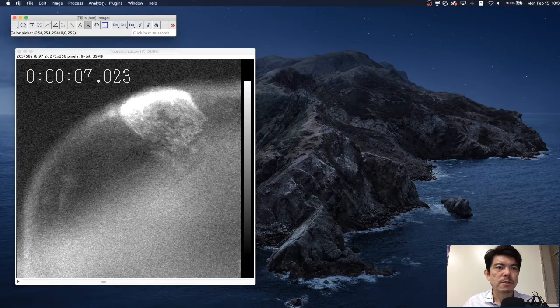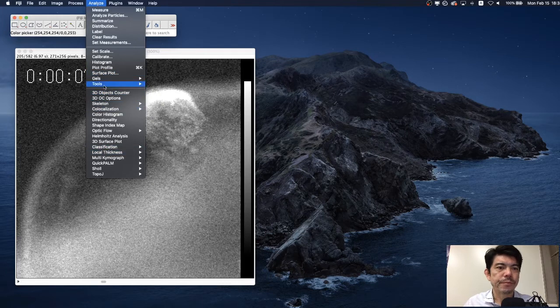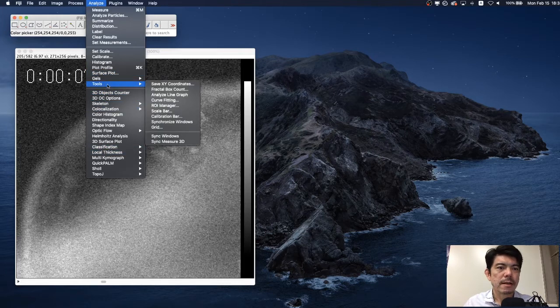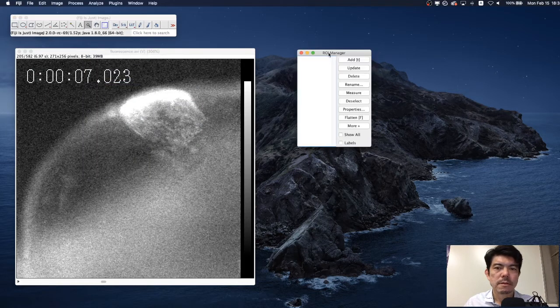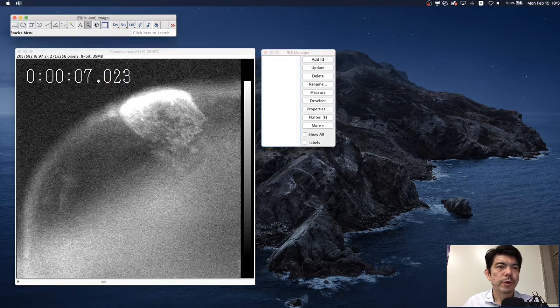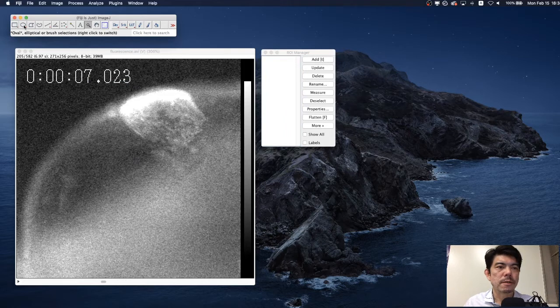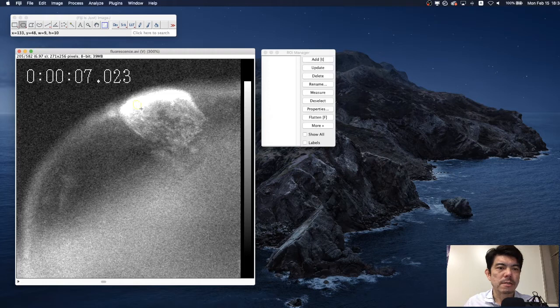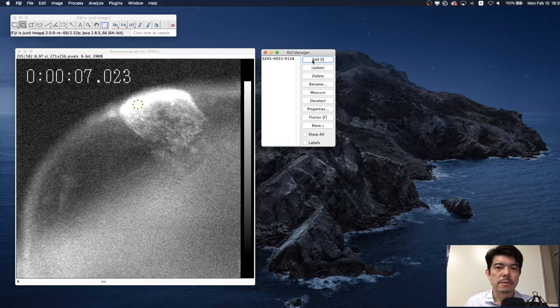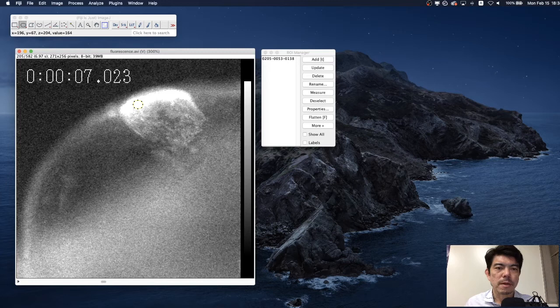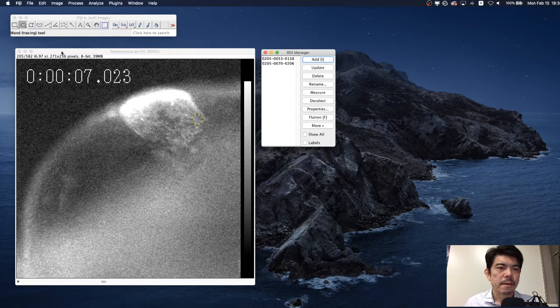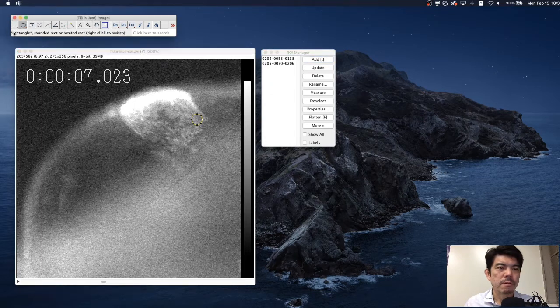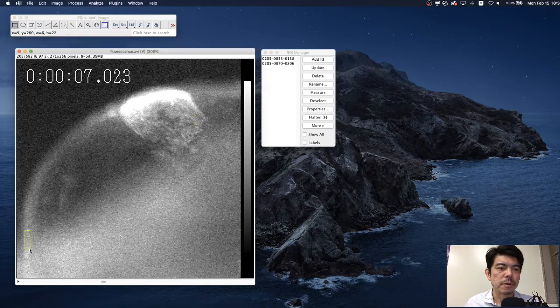For that purpose, we are going to open the analyze tool and ROI manager. This is it. And we are going to select the ellipse tool and we select this place as the number one region of interest. Add ROI. And next interesting place may be here. Add ROI.